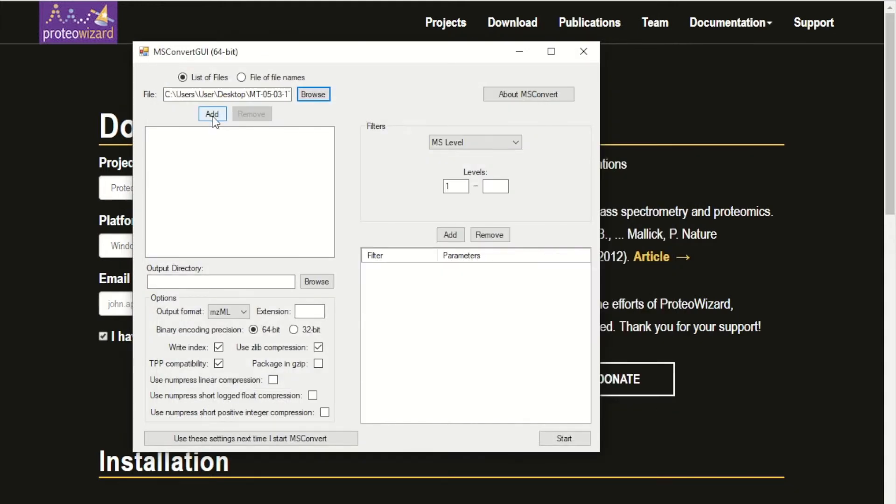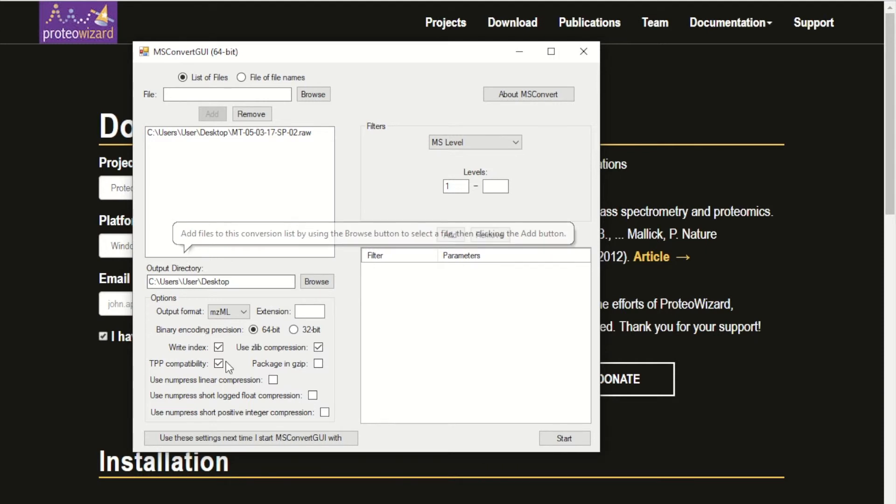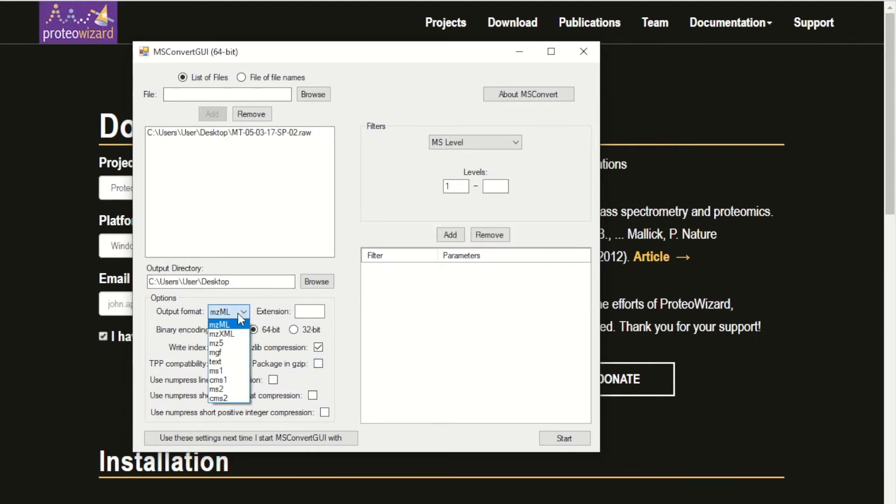Now you can just click add. Next, check the output format tab and make sure it's in mzml format.